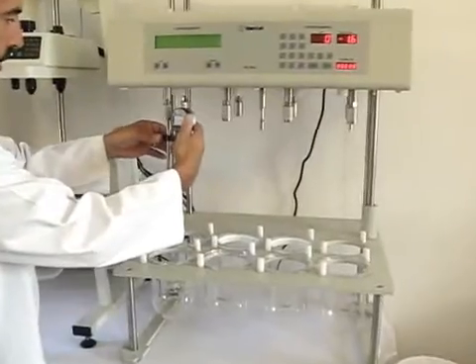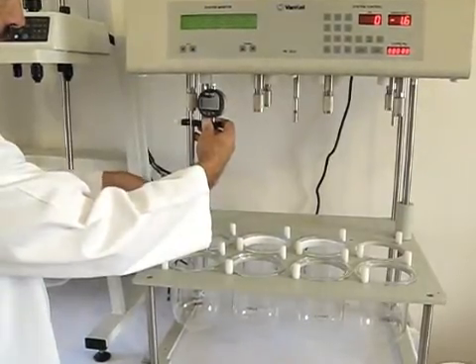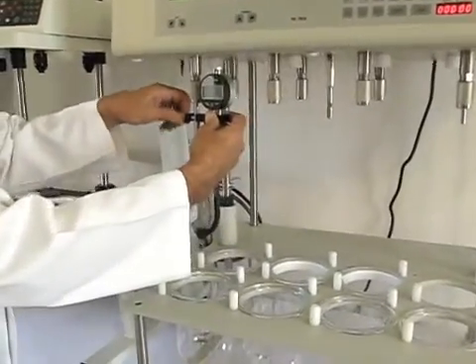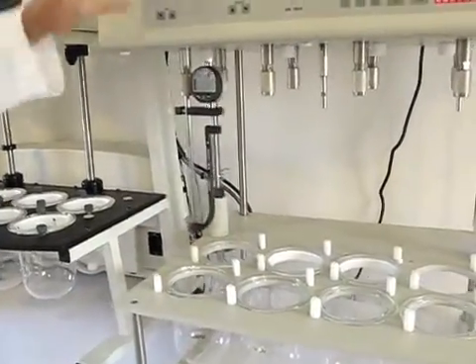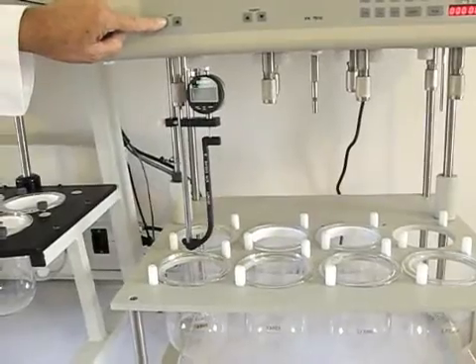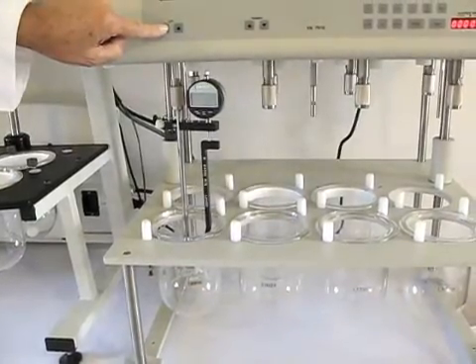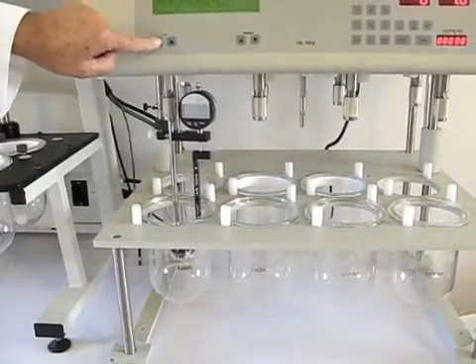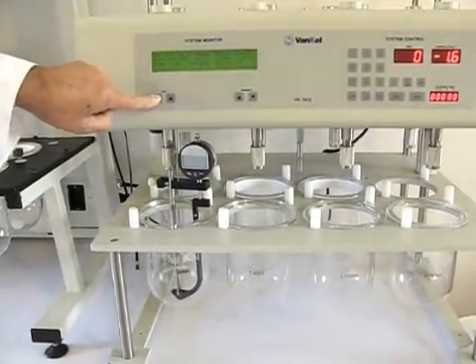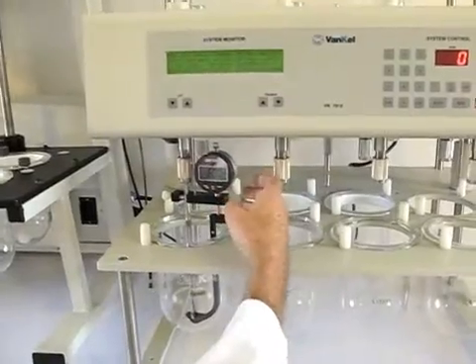VK7000, and what we're going to do is install the measuring device onto the shaft. I'm going to lift it up until the top of the gauge touches the bottom of the paddle shaft. Turn the lock screw, connect it. Then we're going to lower the device to the operating position. Then we're going to come down here and take a closer look, turn the gauge on.